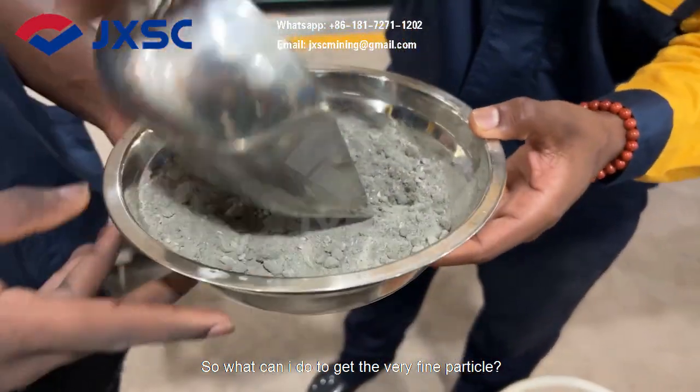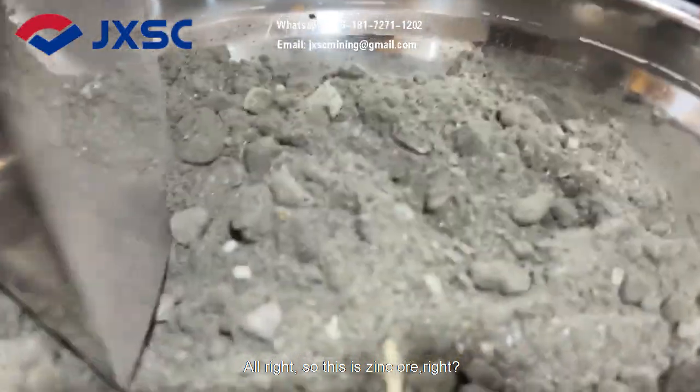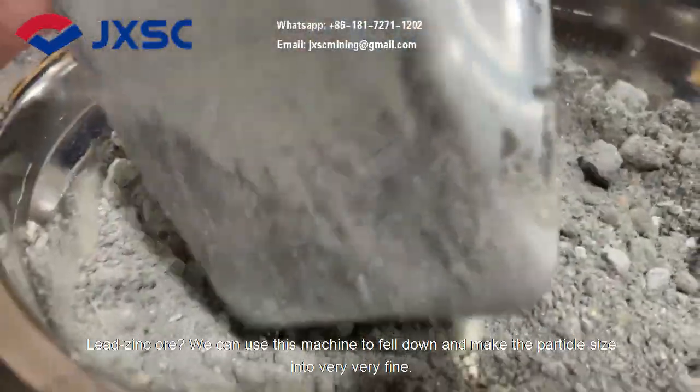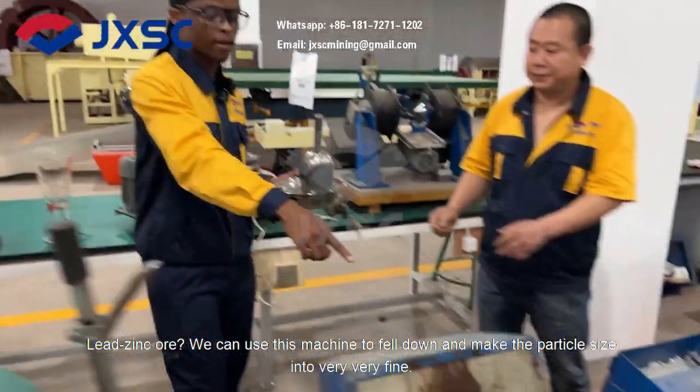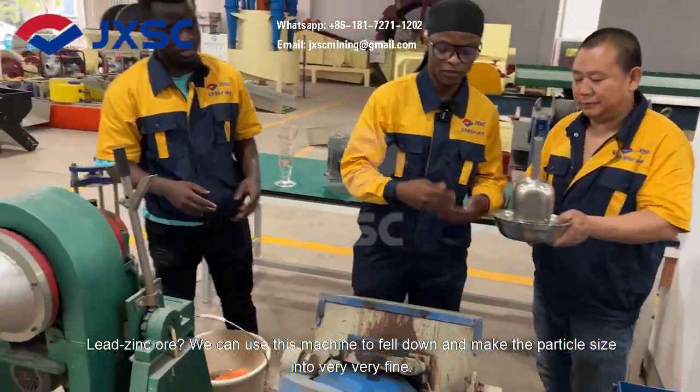So, what can I do to get a very fine particle? Alright, so this is zinc ore — lead-zinc ore. We can use this machine to further reduce the particle size into very, very fine.